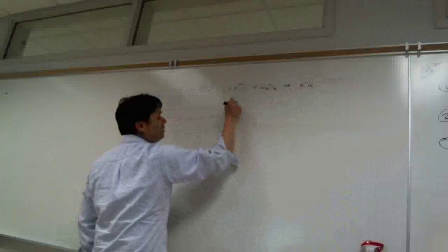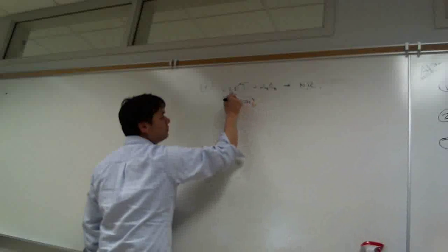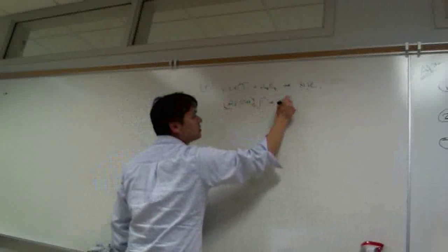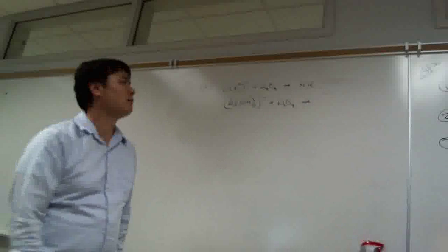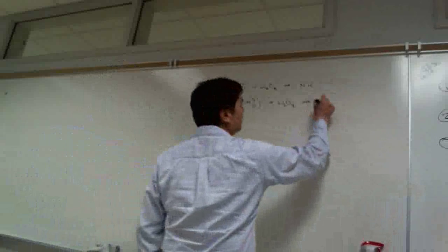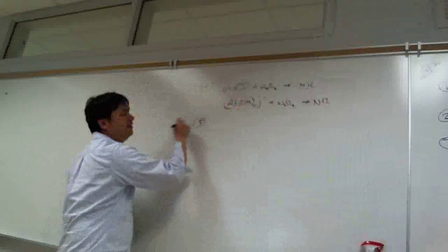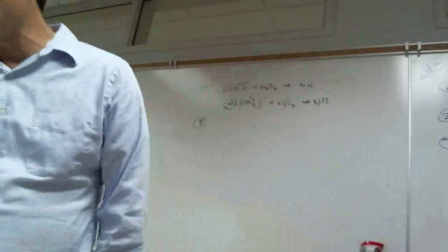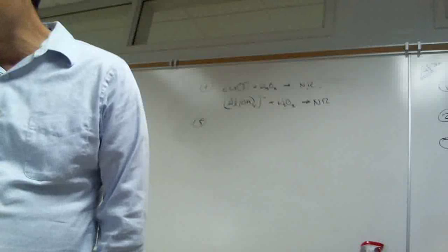I mean, can you oxidize the aluminum further? I mean, it's already plus 3, so is it possible to oxidize it to plus 4, let's say, or plus 5? No. And so here we're going to get no reaction as well. And then we heat to remove the hydrogen peroxide, but I'll show that in a different step. I'll show that after we actually use it.